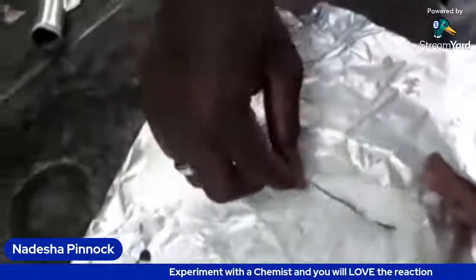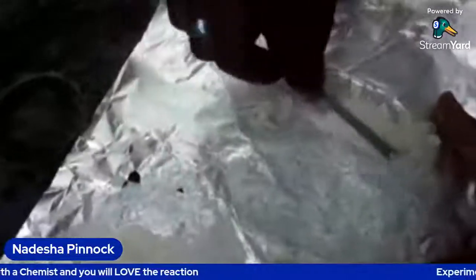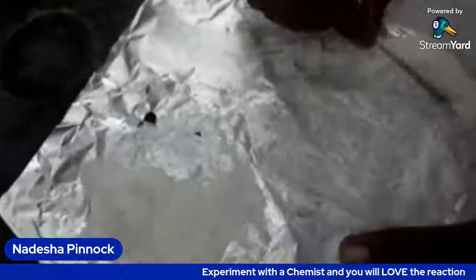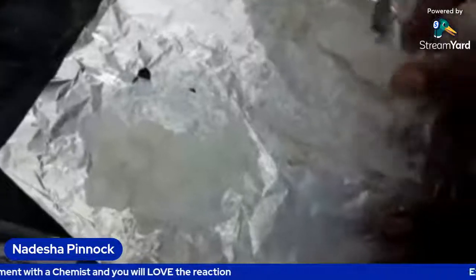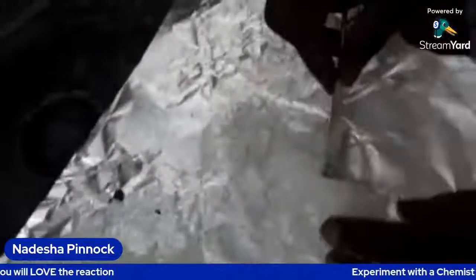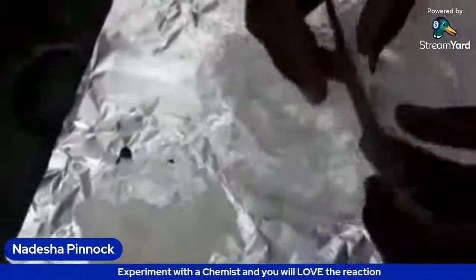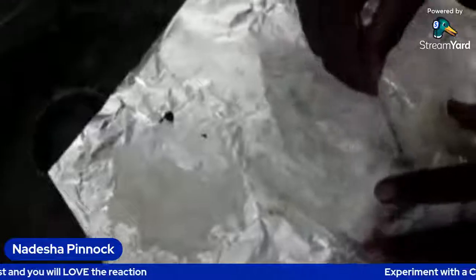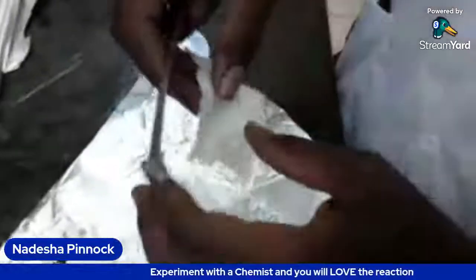So we're taking off the plastic now, guys. Bioplastic, that is. Trying to see if I can mold it into something. And it's hot, by the way. So the top part, you can see that the top part dried a lot more than the bottom. And obviously that's because we heat it by convection. There you go, guys. Look at that.